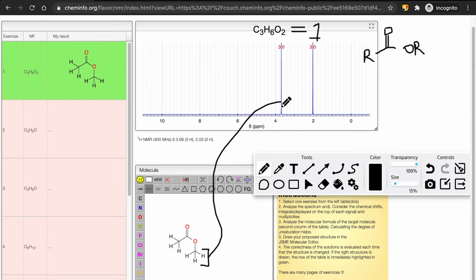these hydrogens, so they probably correspond to the signal here. Okay, and these 3 hydrogen, remember the integration is 3, these 3 hydrogen at about 2.1, remember 2.1 is kind of like a magic number, tells us that those hydrogen are probably adjacent to a carbonyl. So it would be these 3 right here. Okay, and it makes sense too that they're singlets. So singlets, remember, via the n+1 rule, if it's a singlet, that means n equals 0. There are 0 neighbors that these hydrogen have. So these 3 hydrogen have 0 neighbors, and these 3 hydrogen have 0 neighbors. Okay, let's try the next problem.